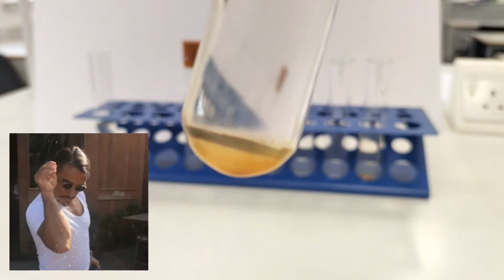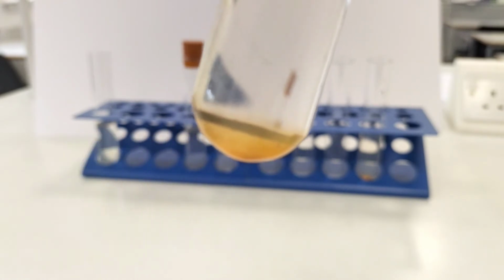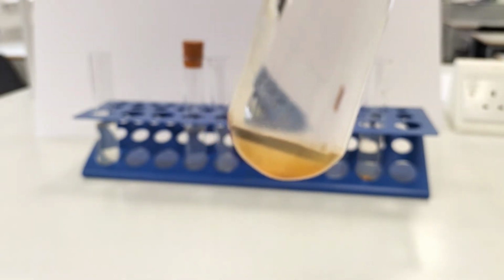Now, experiment 2 had a little pinch of salt in the water. And it appears to be the case there is more rusting around the nail with the salt water than there was with the ordinary water.